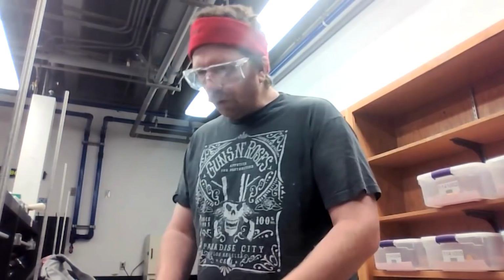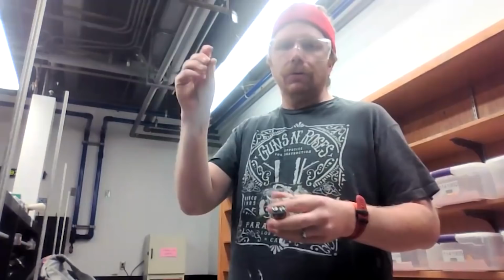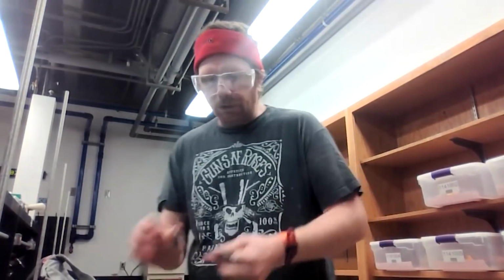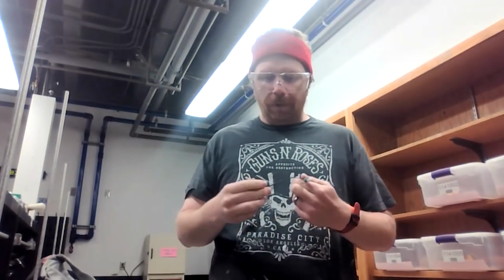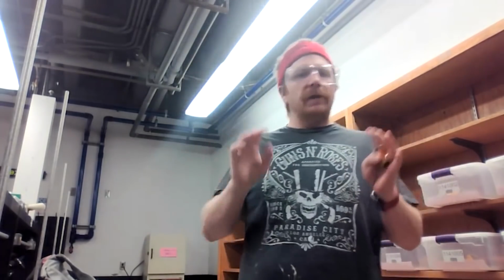What we're going to be doing, and this might take a little bit of contorting on the camera here, is putting different solutions into this 100 milliliter beaker, and testing whether the electric current can flow through this battery, then through this solution, and then be completed to light up these lights. But before we get into that, the first part of your experiment is these are known as controls, positive and negative controls. Positive and negative controls are maybe the most important part of any scientific experiment because they give you a foundation and a basis for comparison.